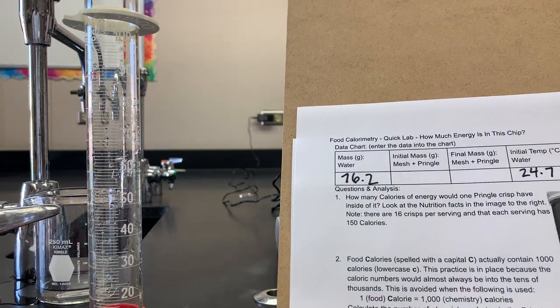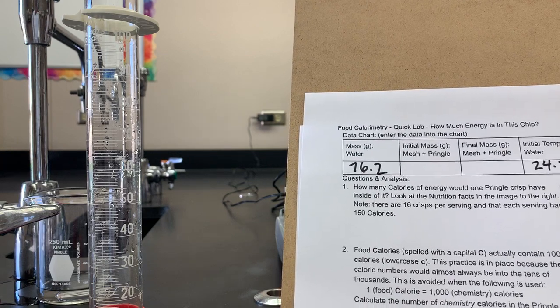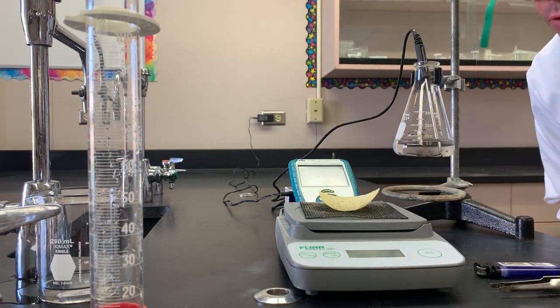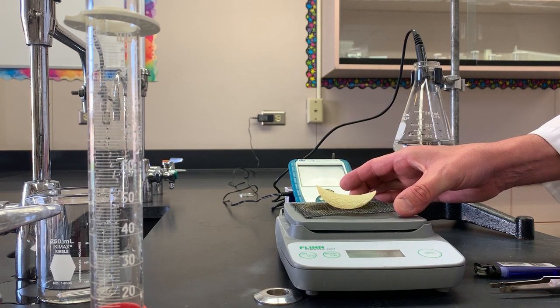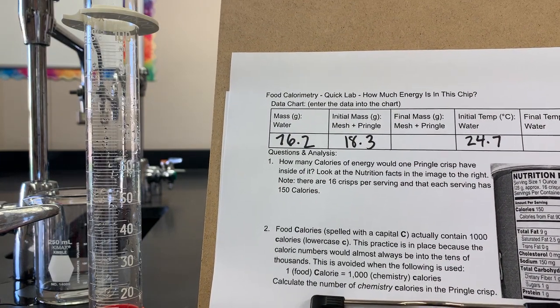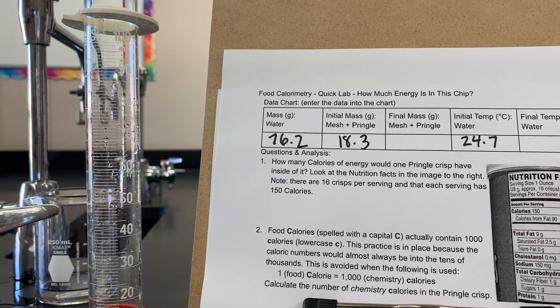We may have missed a step, so I need to address that right now — and that's the initial mass of the mesh plus the Pringle. Getting the wire mesh on the balance, the Pringle on the wire mesh, zero the balance first — it's always a good thing. The mass that the balance is showing is 18.3. So this is our initial data set: the mass of the water, the initial mass of the mesh and the Pringle together, and the initial temperature of the water.